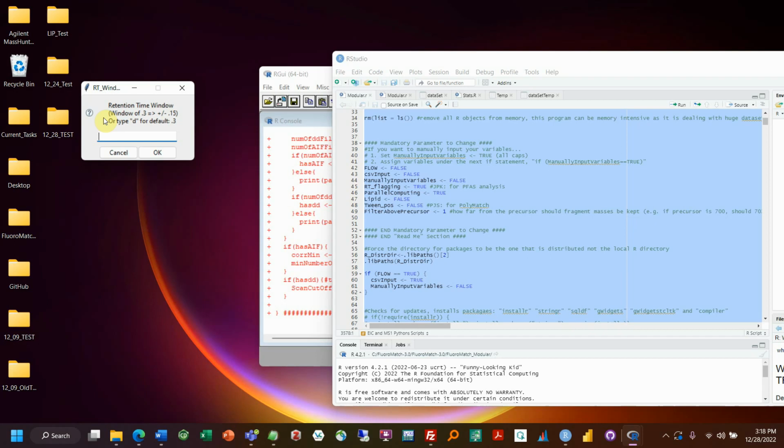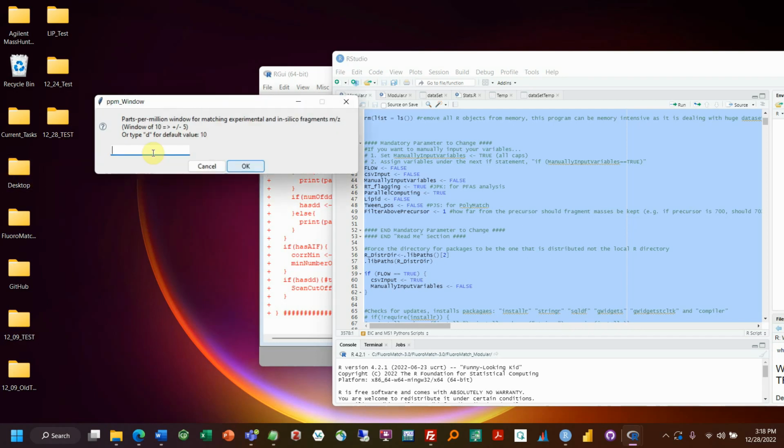It would look for MSMS scans. The narrower the window, the fewer false positives, the less chance you get for chimeric mixed spectra that don't belong. So sometimes I like to even put this lower, so maybe like 0.18, so plus or minus almost 0.1 minutes, or even 0.1, so plus or minus 0.05 minutes. So it depends on your peak widths, all that. So for this case, I'm going to put 0.18, make it a little narrower to get fewer false positives.